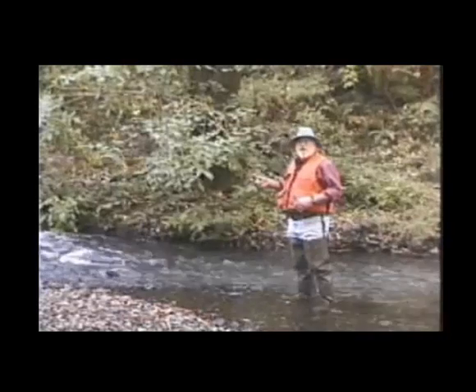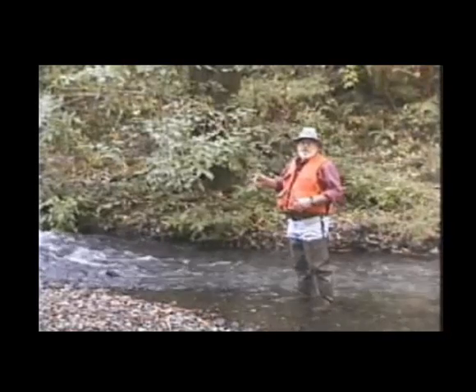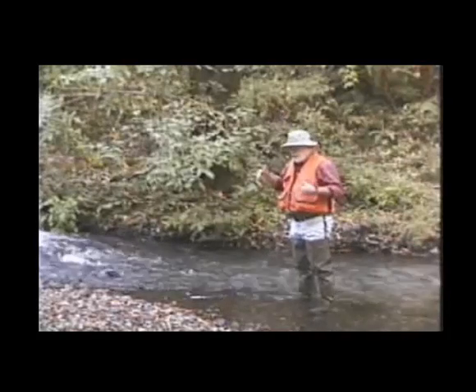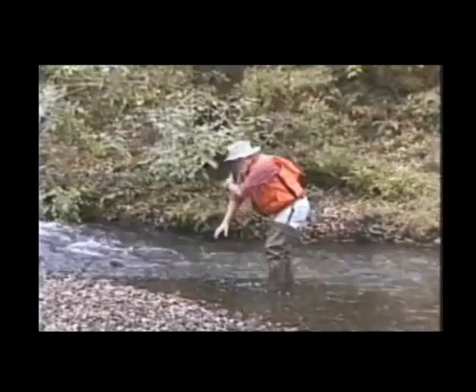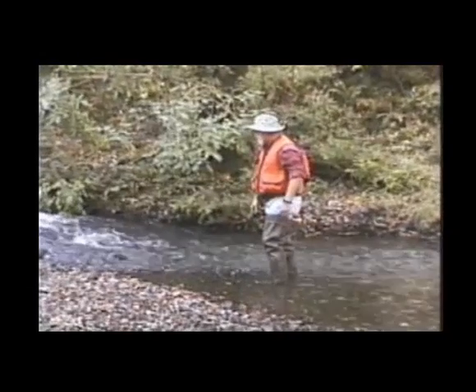And a secondary consideration is that taking a sample in swiftly moving water can be very difficult. Even though it may be safe to wade, if it is moving very quickly, when you reach down and put your hand in the water, you're going to get a bow wave coming up your hand, so you have to be cognizant of that.